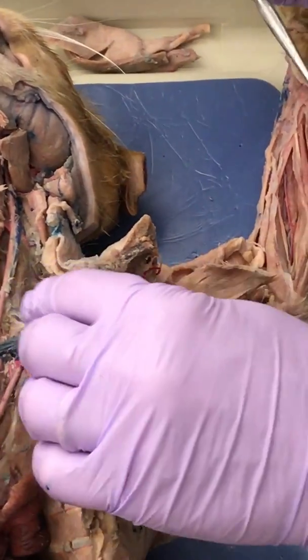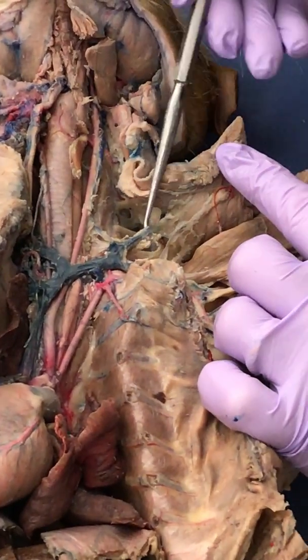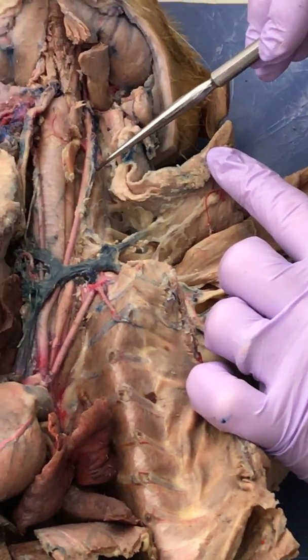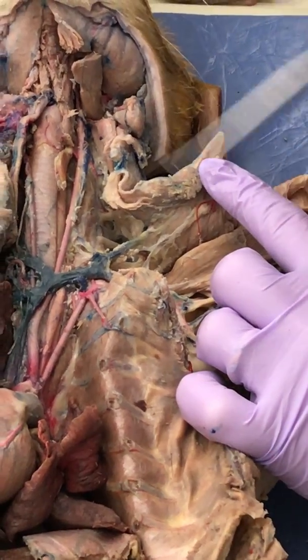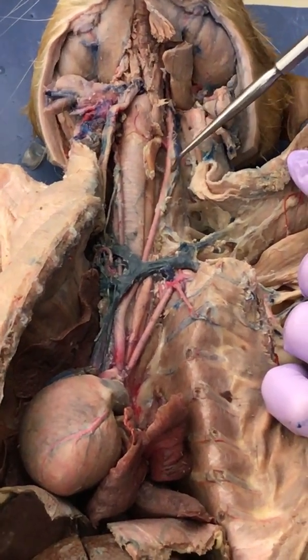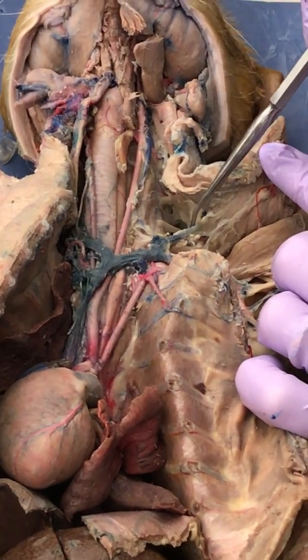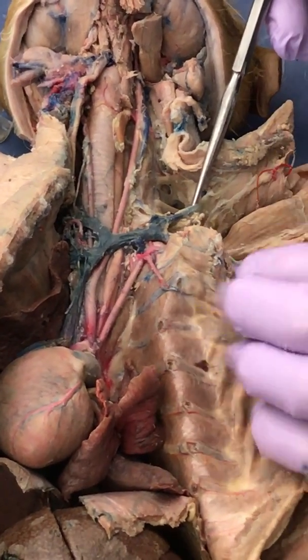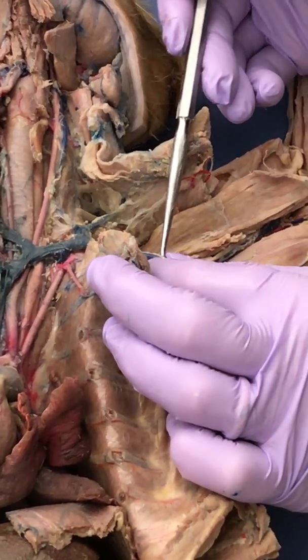While we're up here, let's talk veins, because your cat's really good on veins. Your cat has an external jugular here. Your cat also has an internal jugular. It usually doesn't fill with latex well for the other cats, so that's why it's not on our list. But your cat has that. Don't we have one jugular? Yeah, external. Right, okay. And then this is your cat's subclavian vein.